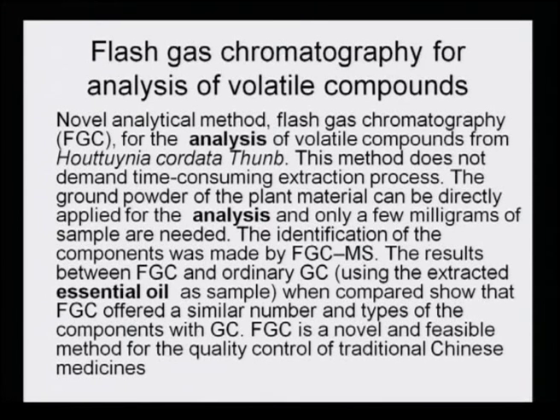This is the biological name of a plant. This method does not demand a time-consuming extraction process. The ground powder of the plant material can be directly applied for the analysis, and only a few milligrams of the samples are needed. The identification of the components was made by the flash gas chromatographic technique with the mass detector.